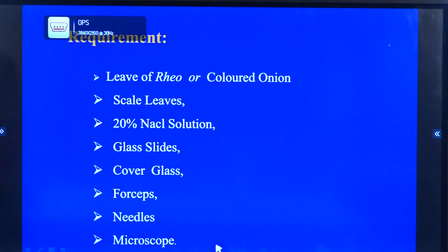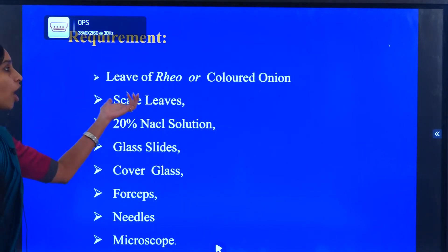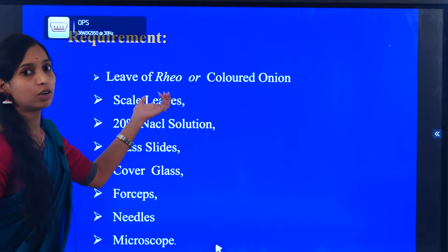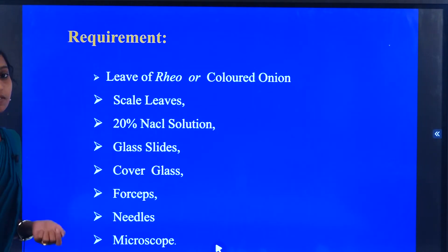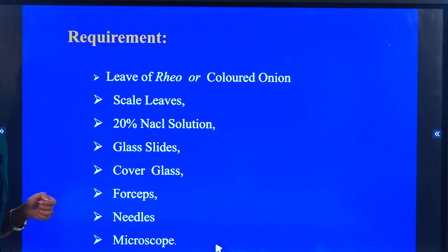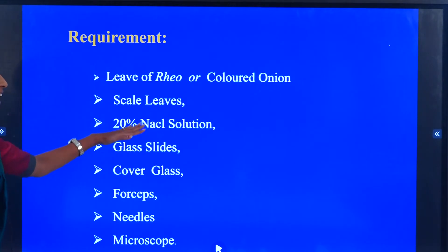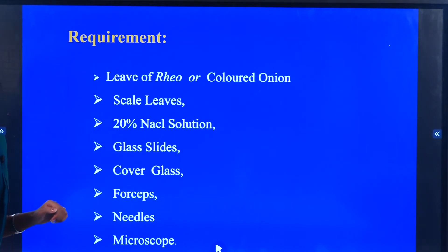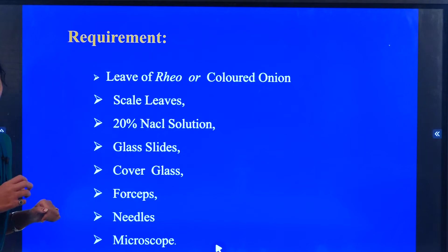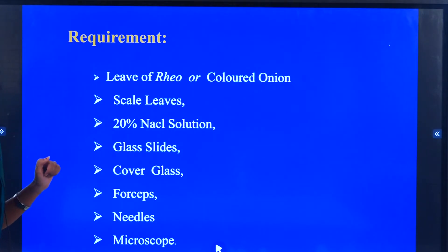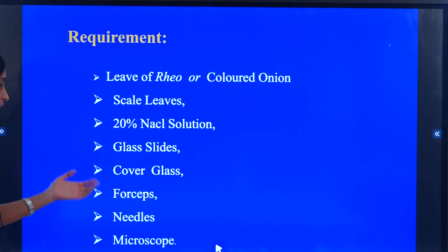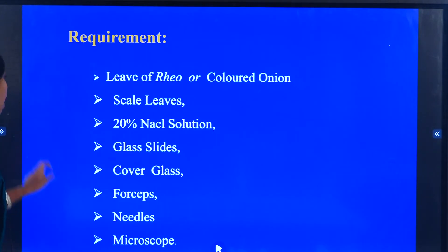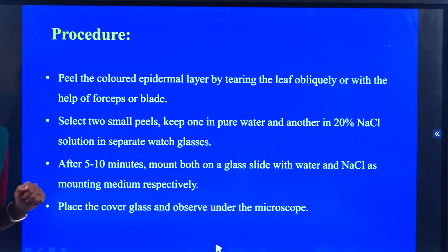What are the requirements needed to conduct this experiment? Fresh onion with a colored pink layer — we use the real epidermal leaves for this experiment. We also need 20% NaCl solution as the hypertonic solution, glass slides, cover glass, forceps, needles, and a microscope.